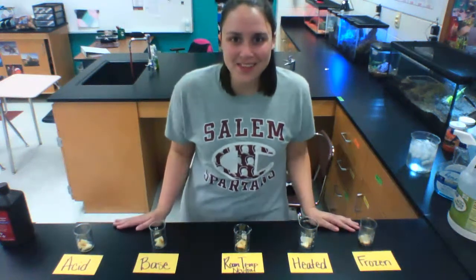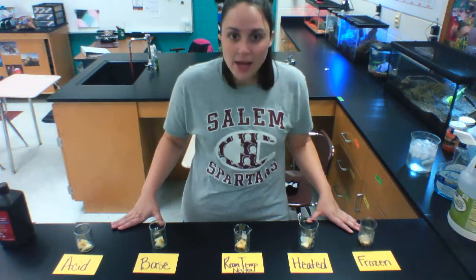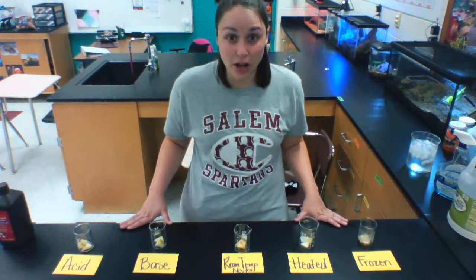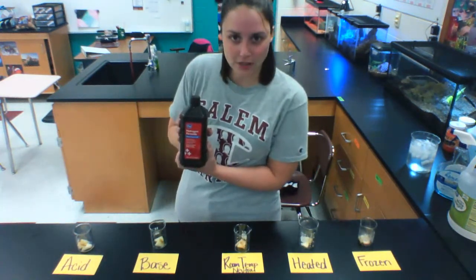Everyone, it's Larson in the lab, and I'm here with our enzyme Peroxidase Lab. We're using potatoes and hydrogen peroxide today. So potatoes contain the enzyme peroxidase, which is going to break down hydrogen peroxide.